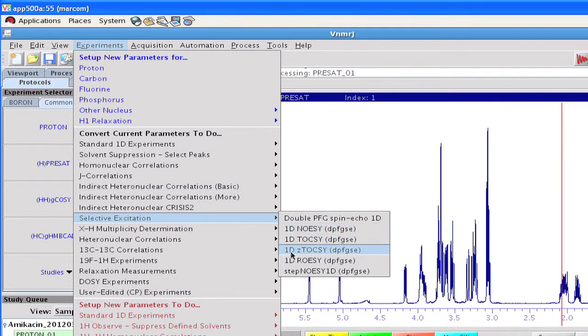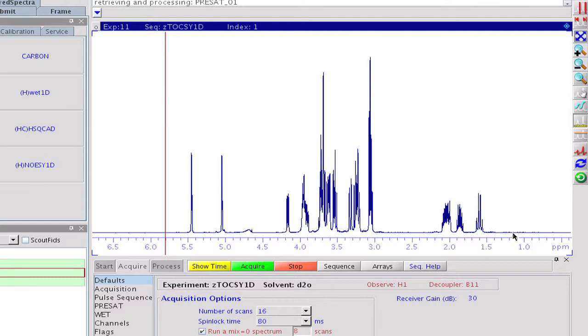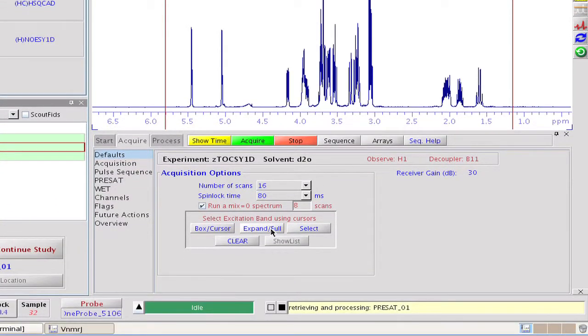By doing so, we import all sequence-specific parameters while keeping all the others that have been optimized on the pre-sat spectrum. The spectral window, for example, or the pre-saturation conditions, just to mention a few.